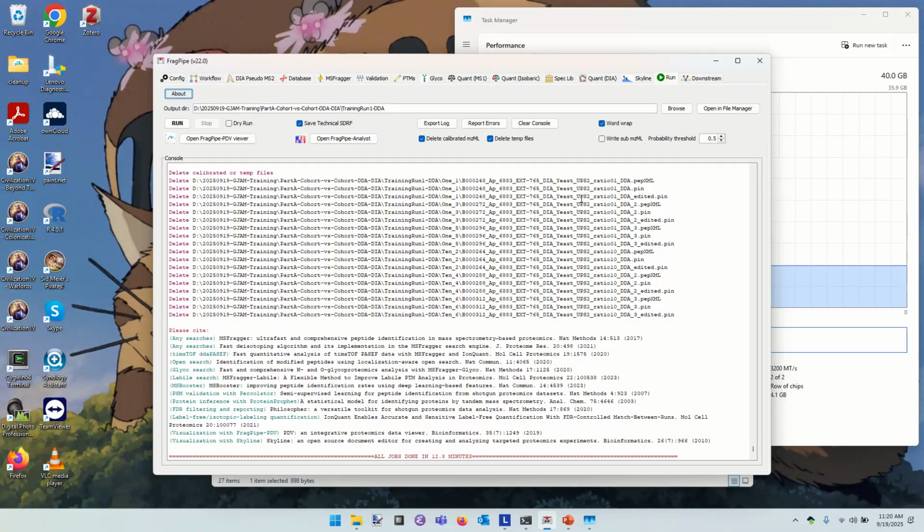But once we get to DIA, we're collecting with a broad window of precursor ions, a range of different mass-to-charge values that we're accepting all peptide ions within, co-fragmenting them, and then reporting their fragments out as an MS-MS. The chief advantage of this is that it gives us multiple MS-MS measurements for peptides.